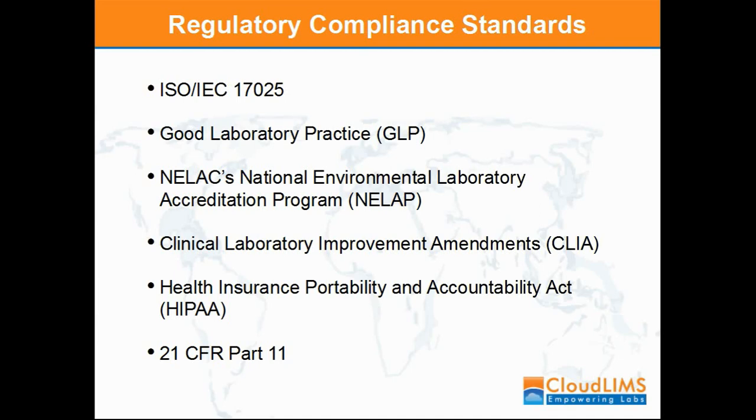Though there is no restriction as far as the selection of a test method is concerned, the test method can be determined based on the requirement of the client. Any new test method, if adopted, needs to be properly validated before implementation. Besides, there should be detailed documentation of the new method for reference and auditing purposes.